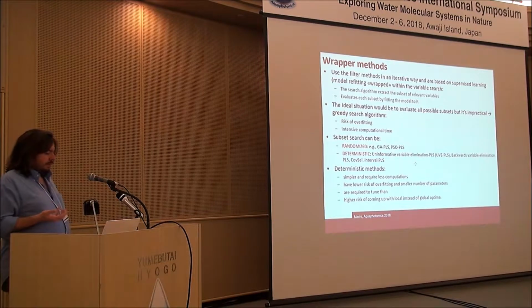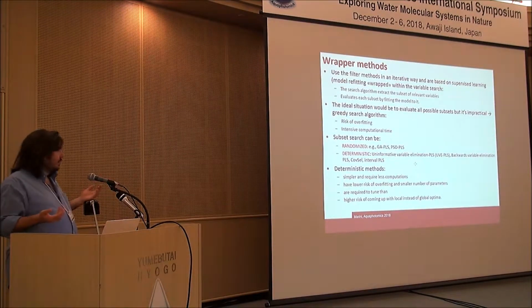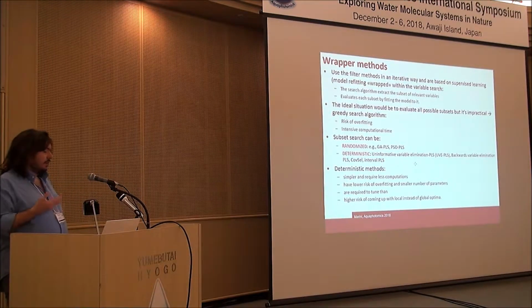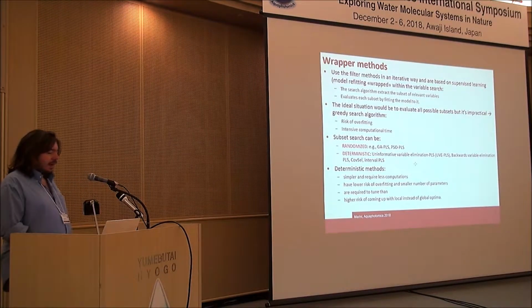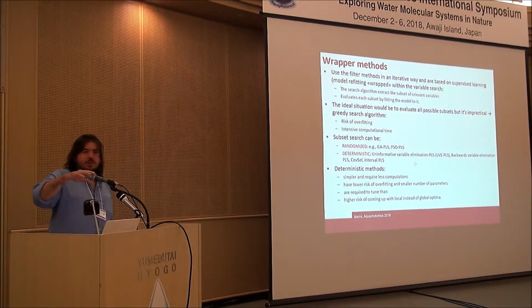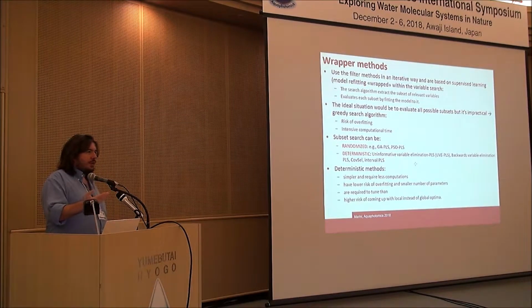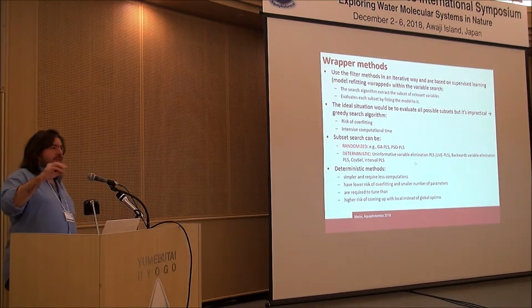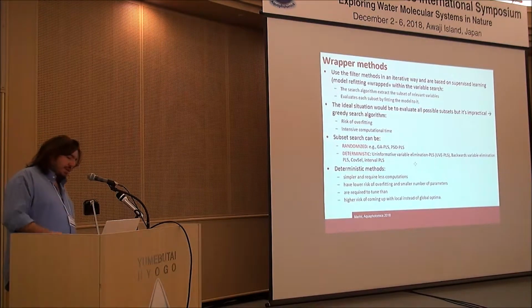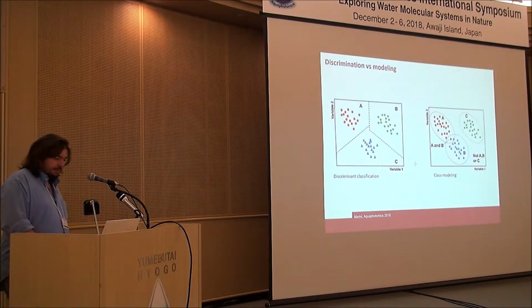So you may get extensive subset search that can be randomized or deterministic, and these are examples of different methods. And the deterministic ones have the disadvantage that the exploration is quite unfavored with respect to the exploitation properties. So you may not try a solution that could seem, let's say, less likely to be tried, but of course they have the advantage of being quite fast.